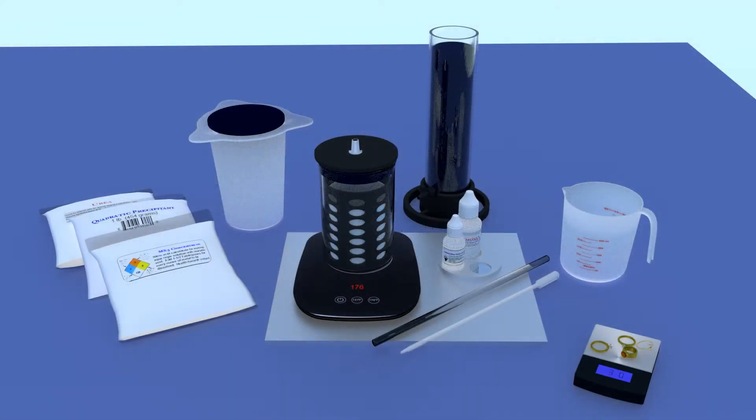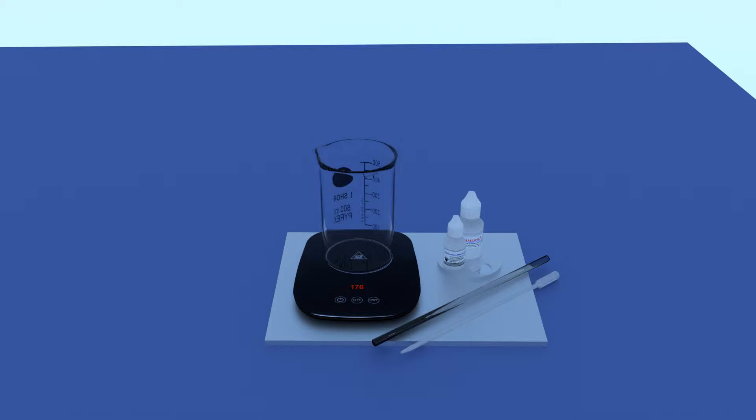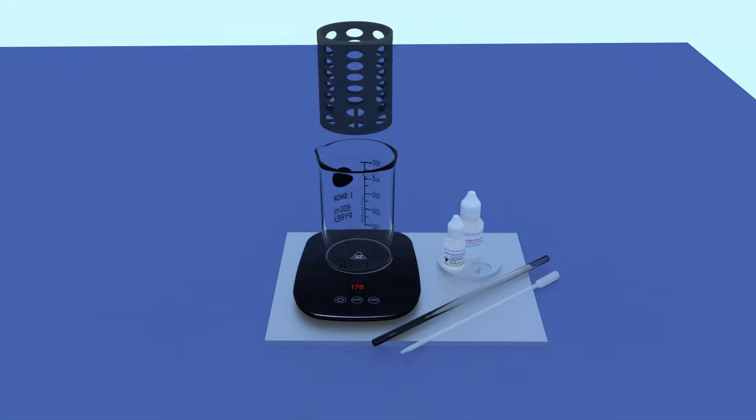The AR2G refining system is very comprehensive and includes all the equipment you will need to refine your gold to 99.95% purity. Components include workstation with spot plate, ammonia detection liquid, precious metal test liquid, pipette and stirring rod, digital hot plate, beaker with basket.